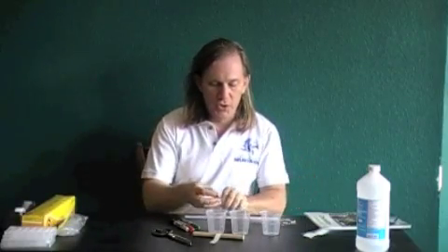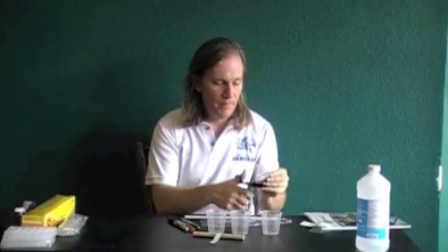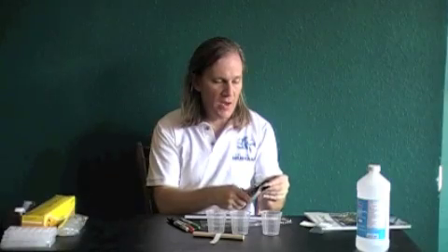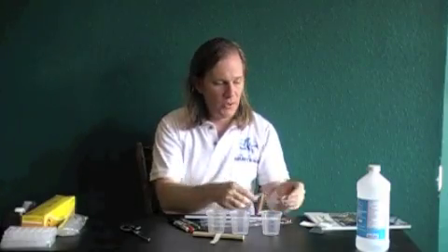To set up this lab, you're going to take some of your filter paper and cut it approximately in half, so that you have two strips of basically equal length. Then take your dowel rod — or you can use a pencil, anything like that — you just need something to support the paper.